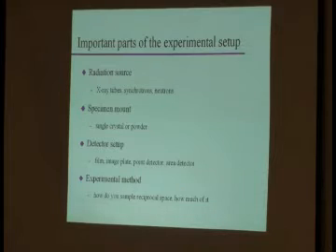One thing that a lot of people forget is the experimental method also matters, because this one determines how much of reciprocal space you can actually image and how you do it. Certain experimental setups have inherent limitations, and in some cases within those limitations you can do everything you want to do, so go for it. But other times you may not be able to accept these limitations. You need to change your experimental setup. So that's something else to consider. What kind of data can you get?